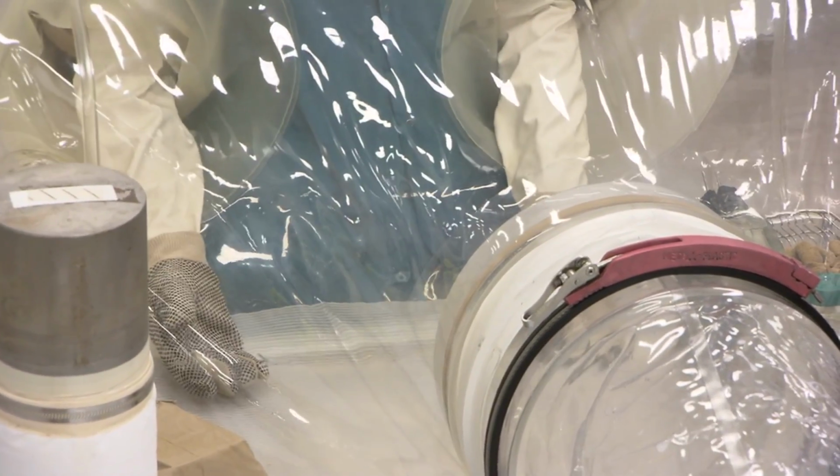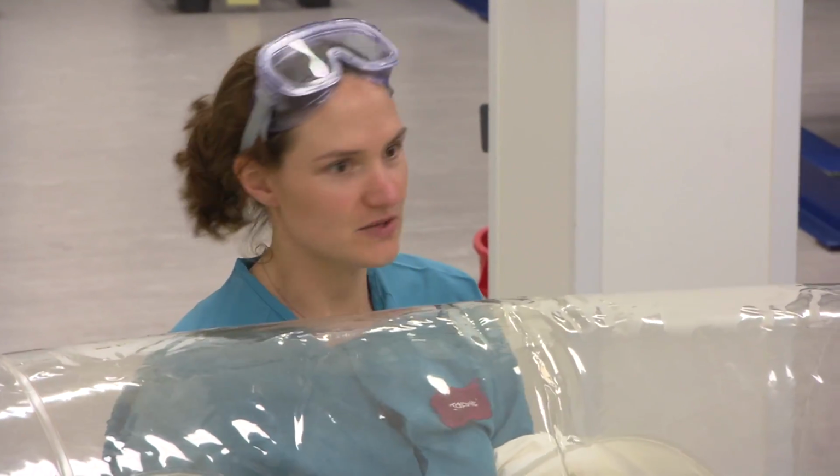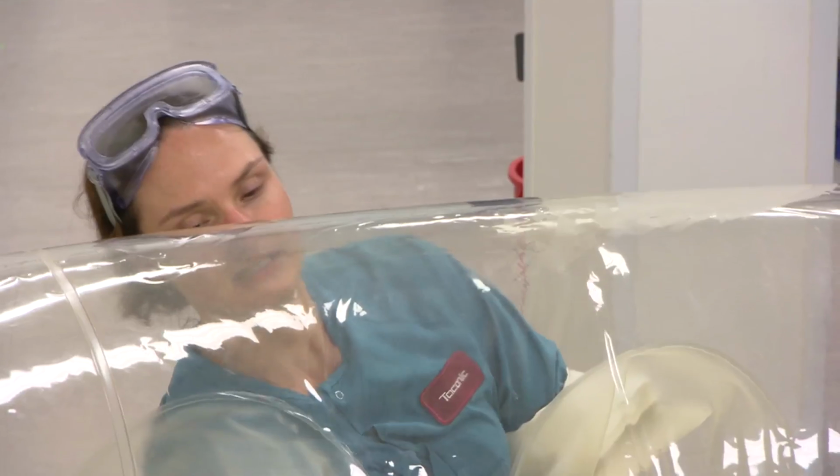So once our 20-minute wait time has elapsed, and again, when we're spraying these, we want to make sure that there is a bubble so we know that there isn't a hole somewhere, and 20 minutes goes by, we still have a nice bubble. You can go ahead and pop off your inside cap.